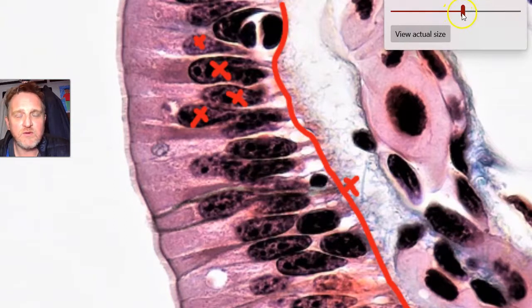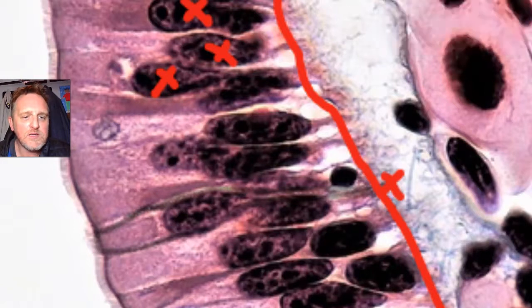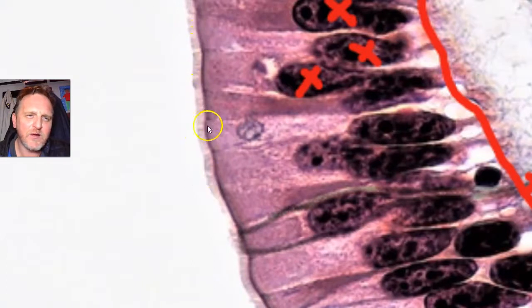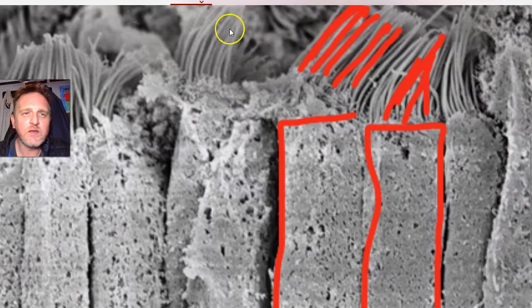And then if we zoom in even closer and we have a look at the apical surface, that means the surface right at the top of the cell, what we get to see is an incredibly fine arrangement of what appears to be little hairs, but are in fact cilia. And we looked at the electron micrograph of this, and you could see these cilia quite beautifully shown. They are dead straight, fine extensions that are embedded directly into the phospholipid bilayer.